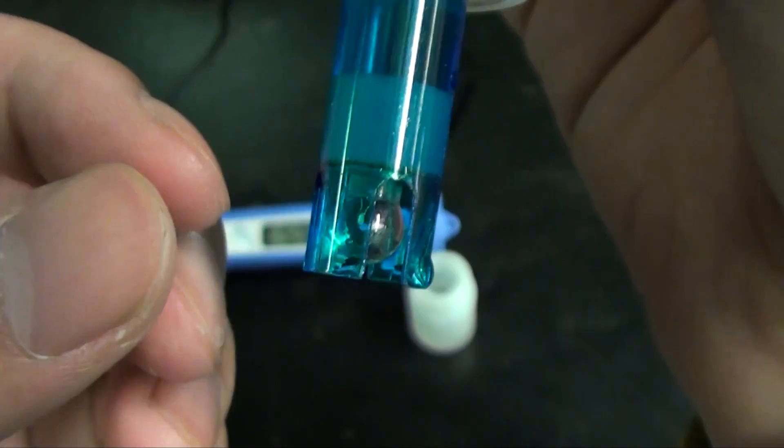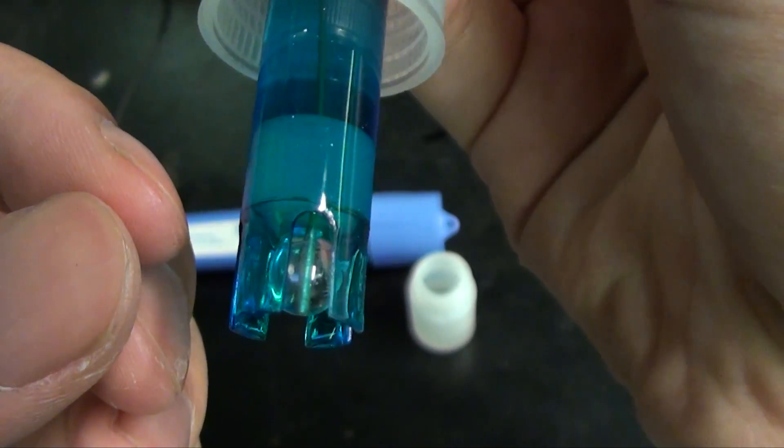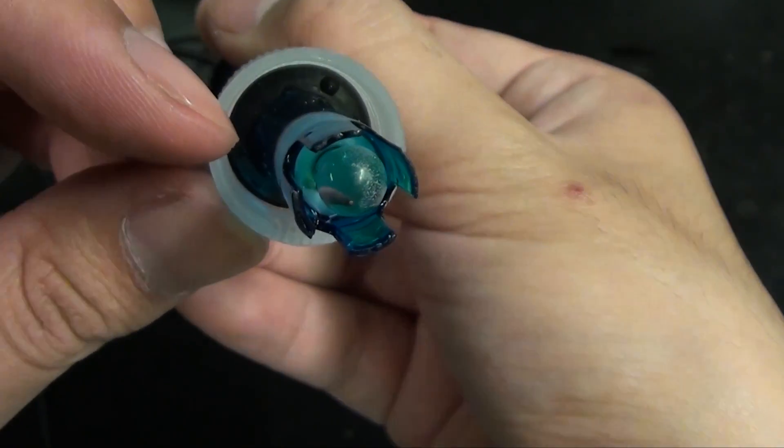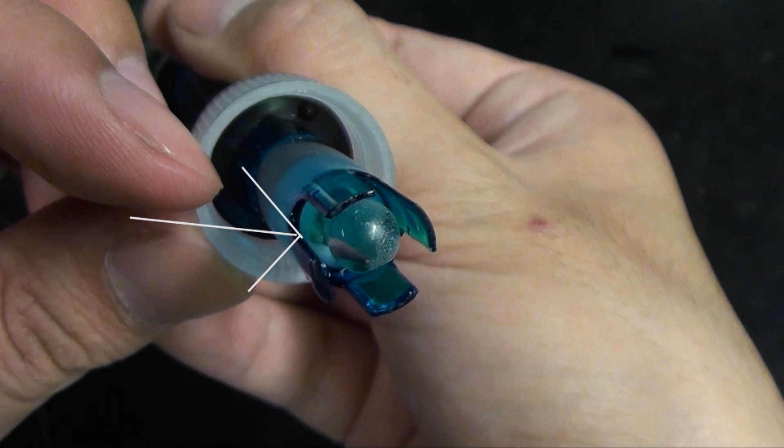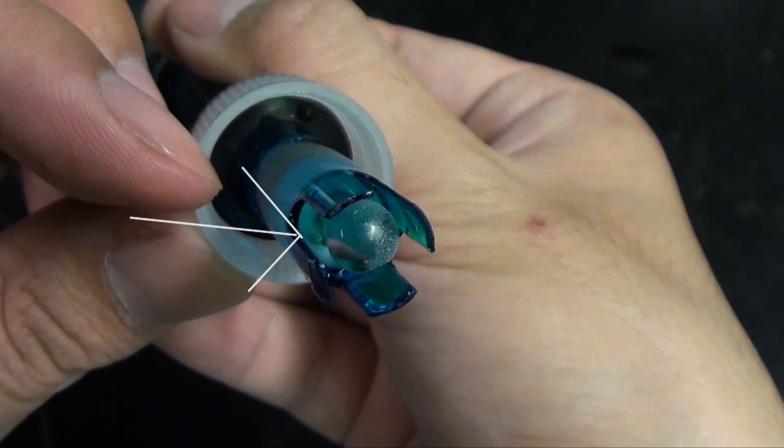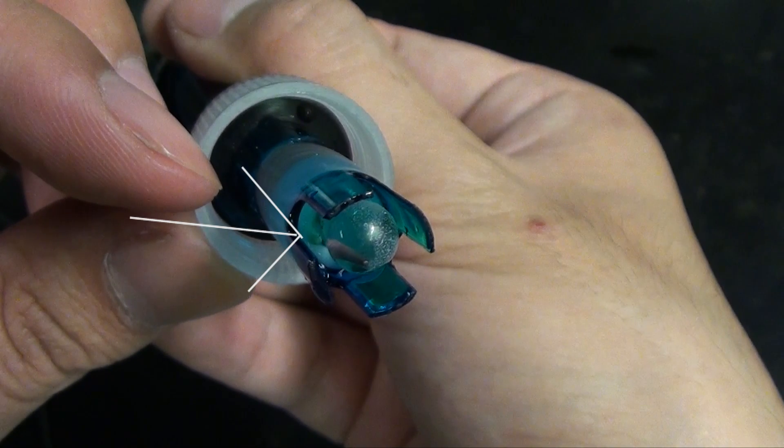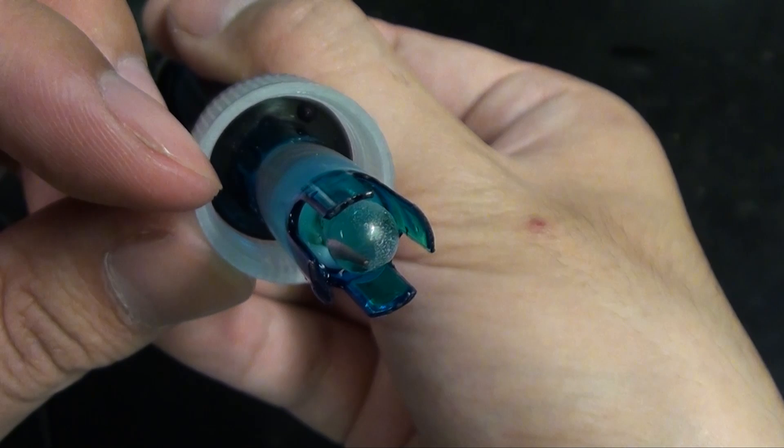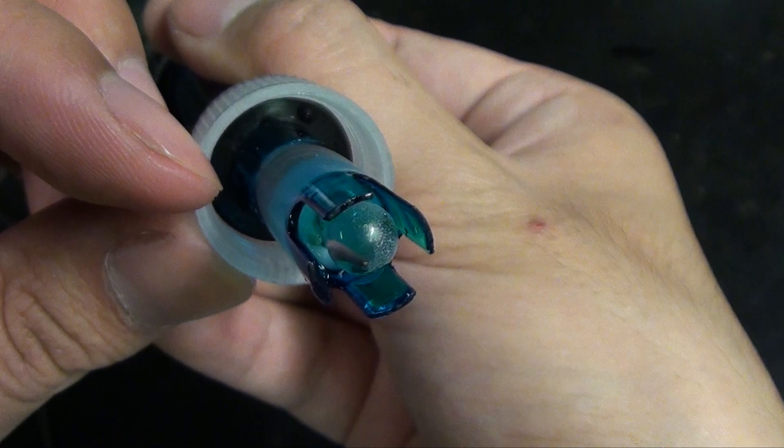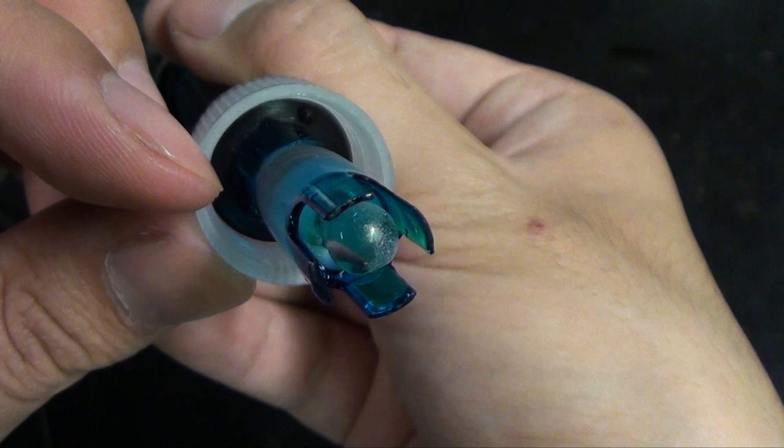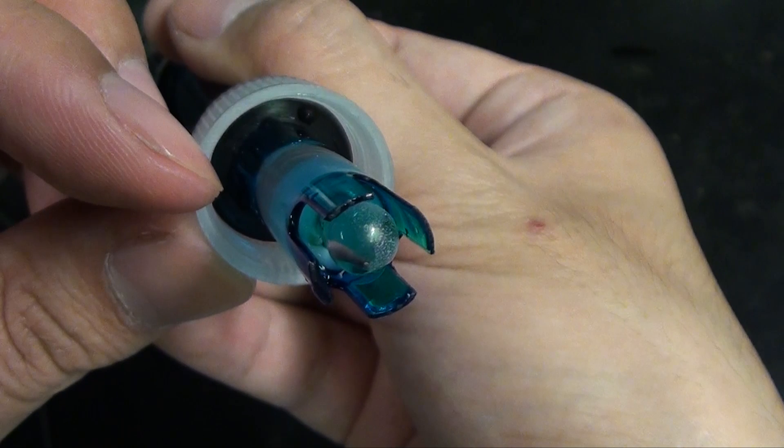Now to measure voltage you need two electrodes. So if I can find it here, there it is. Can you see that little nub there? That is the outer reference electrode. This electrode works with the inner reference electrode to measure the potential across the glass and determine the pH.